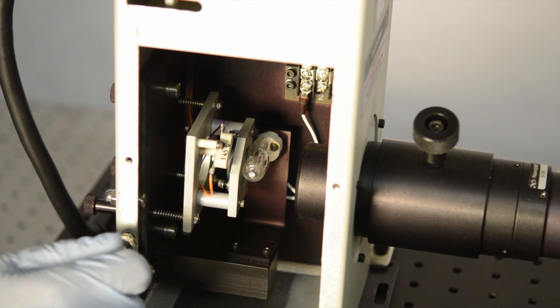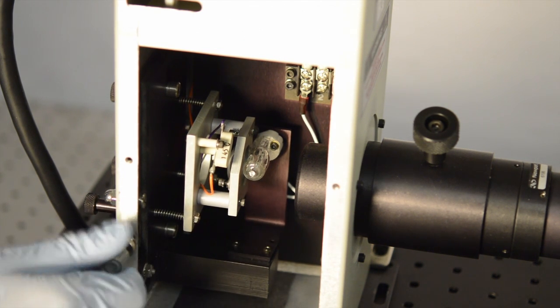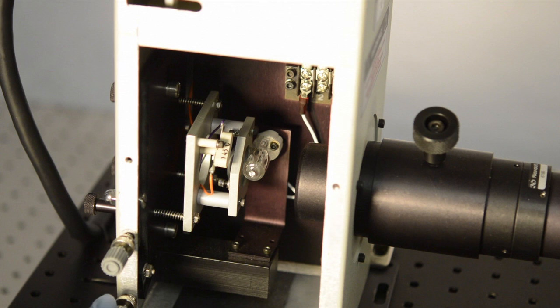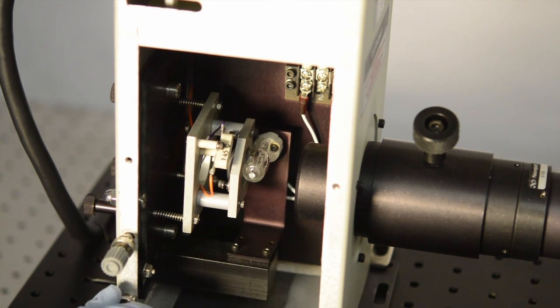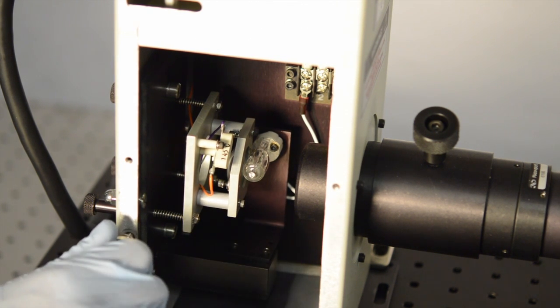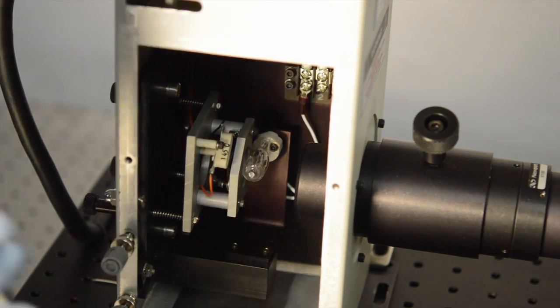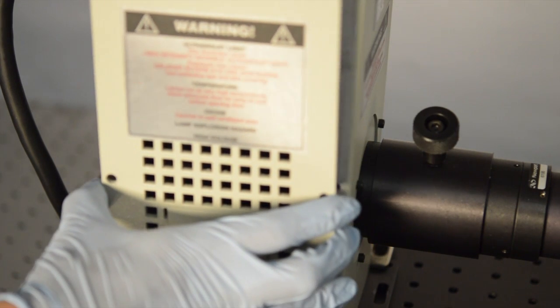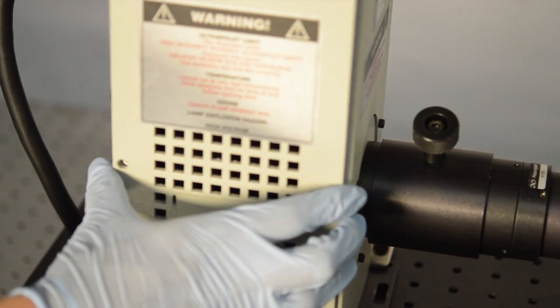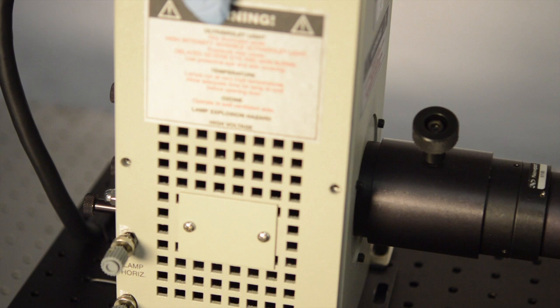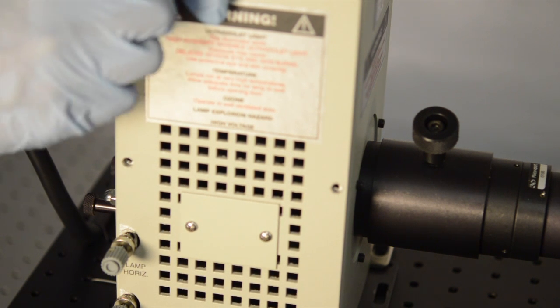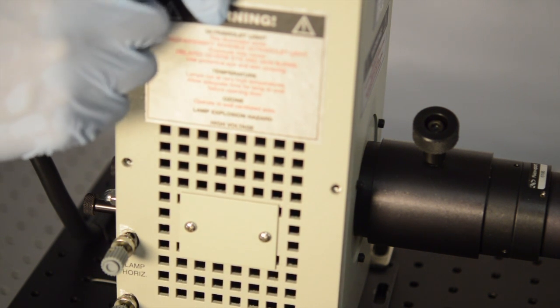Once you're done you can fix the side panel of the lamp housing back on and replace those six thumb screws that were holding the side panel of the housing in place.